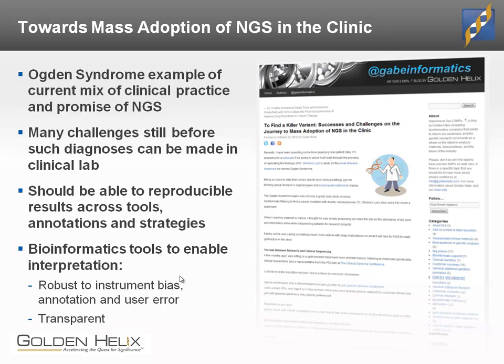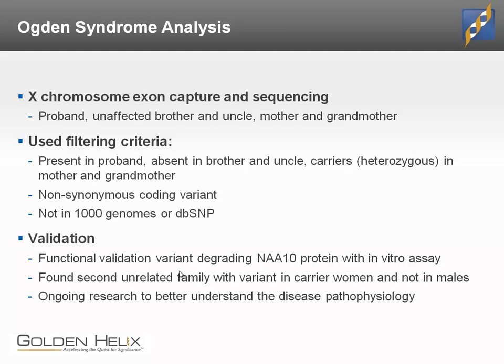And to address all those issues, we can turn to a staple of scientific advancement in a world of rapid change, and that is to, for every finding, find at least one way or multiple ways to validate that finding, to reach that finding using orthogonal technologies or approaches or annotations or algorithms, etc. And so that's essentially the key of what we're trying to do today: take the results of the analysis that was done in 2011 for this paper for Ogden Syndrome, and see if we can get to the same results using the information and best practices we have today.